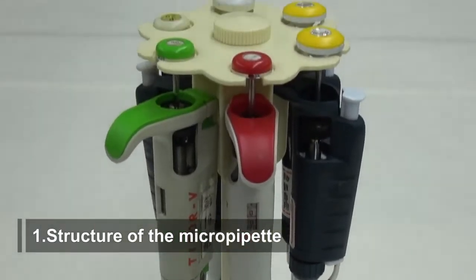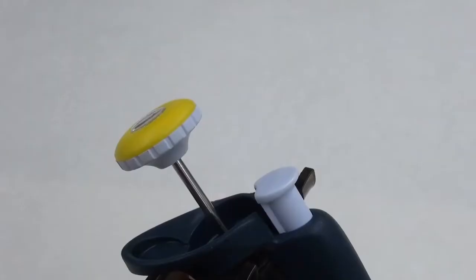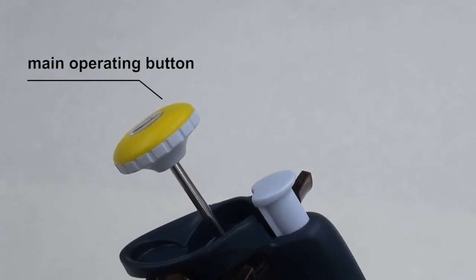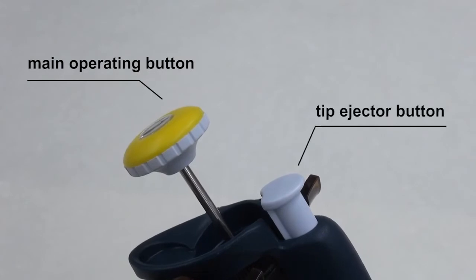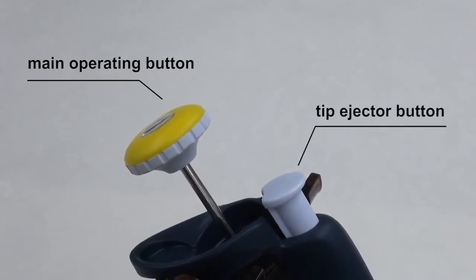Structure of the MicroPipet. At the top of the MicroPipet is the main operating button, which sometimes doubles as the volume adjustment dial. The tip ejector button on the side is used to eject tips.